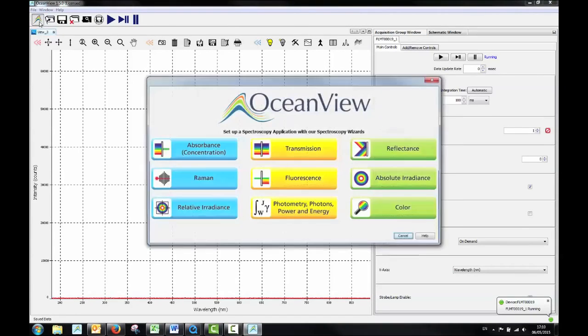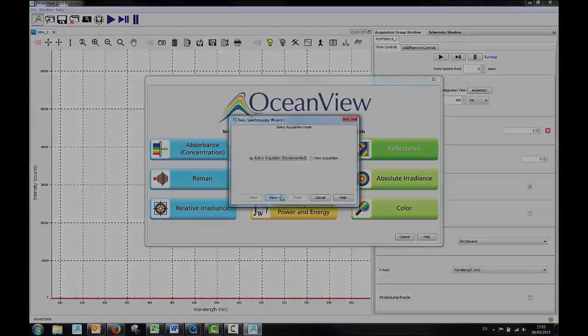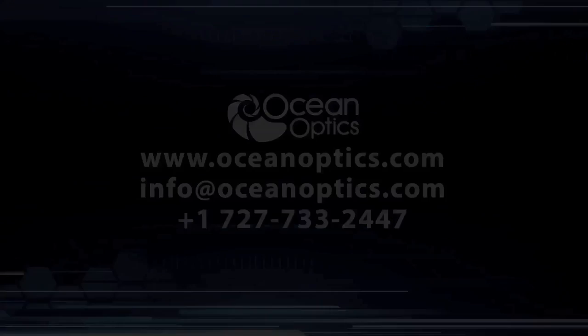Look for additional videos exploring how to perform basic reflection measurements using OceanView. To find out what else you can do using an OceanOptics spectrometer, visit www.oceanoptics.com.